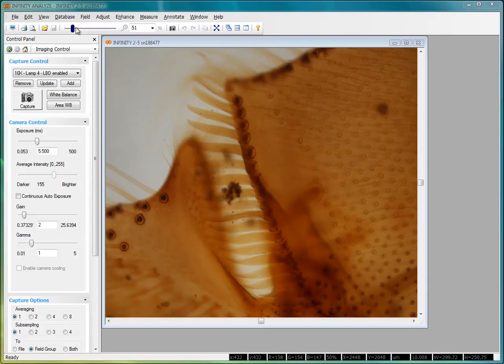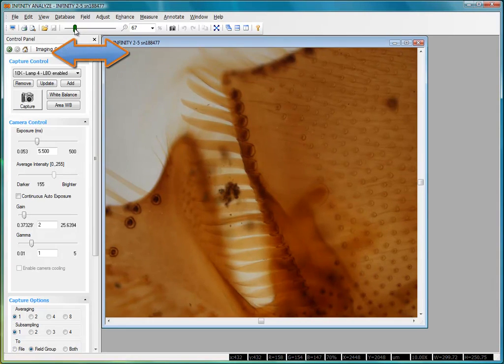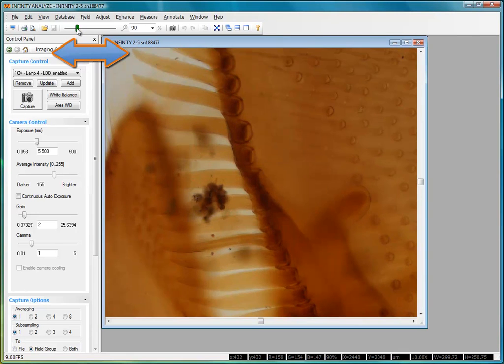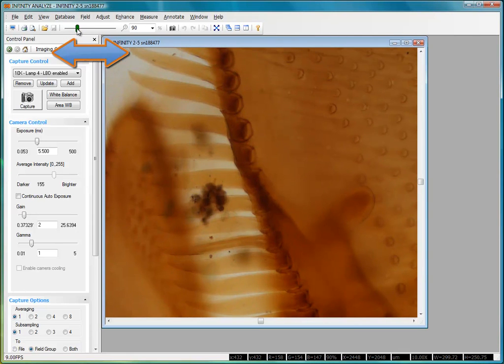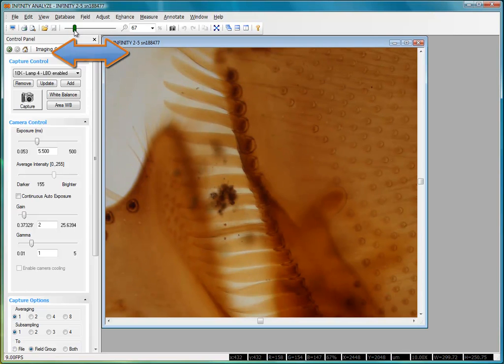With the zoom control available in our toolbar, you can simply click on the zoom control and move it to the right to increase the zoom level, move it to the left to decrease the zoom level.